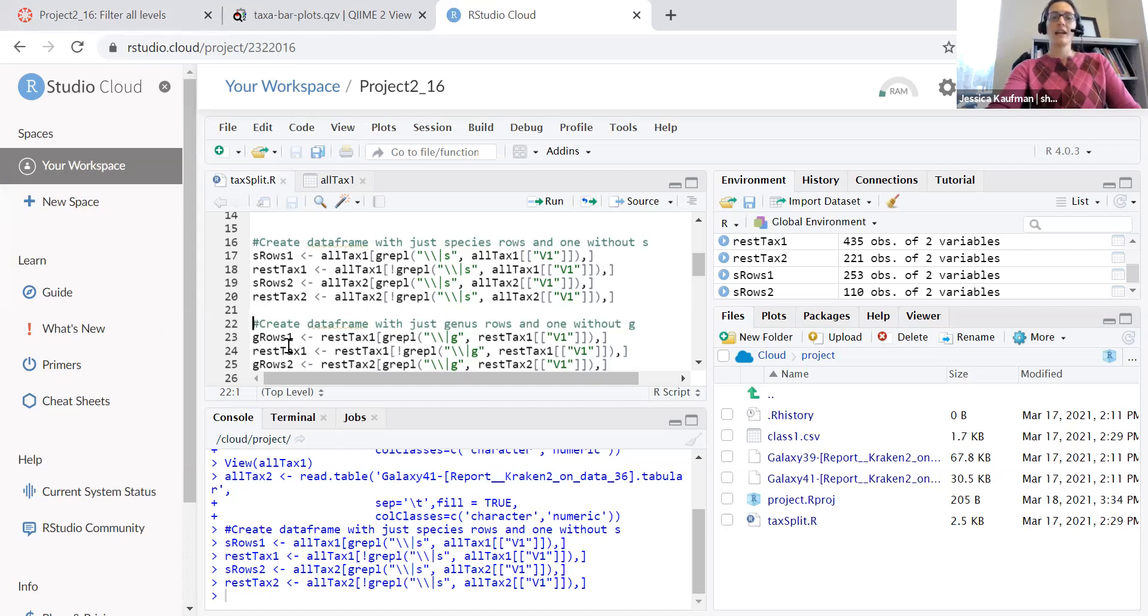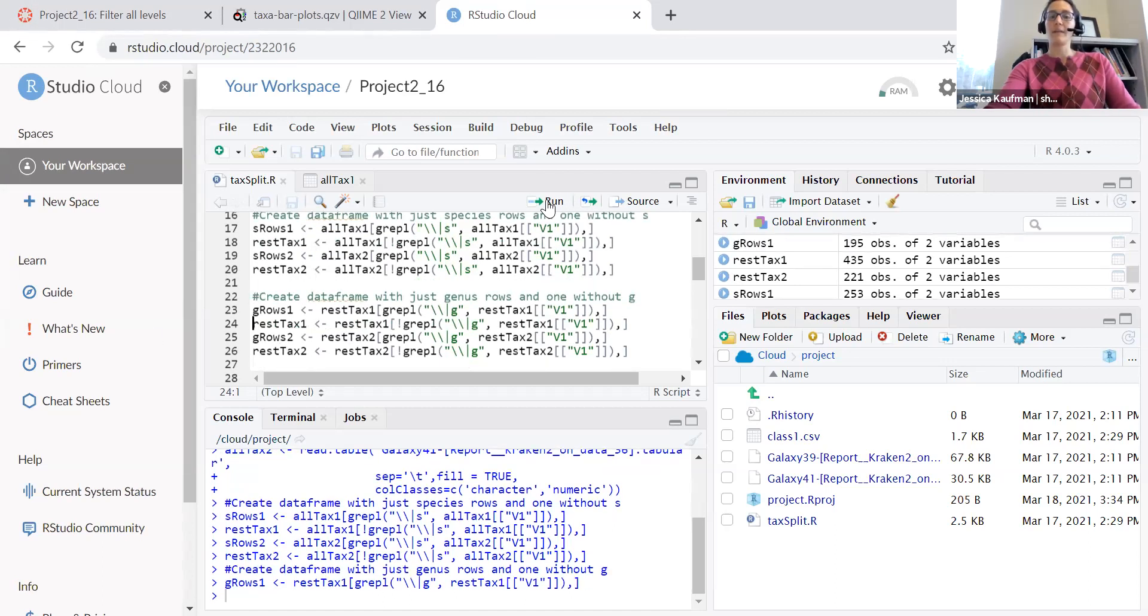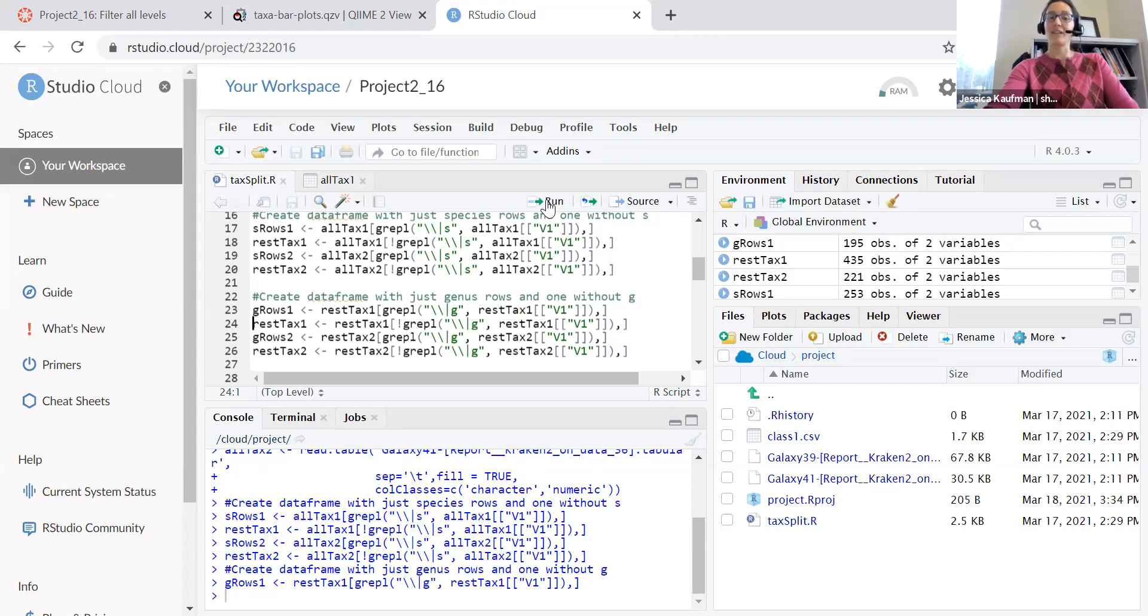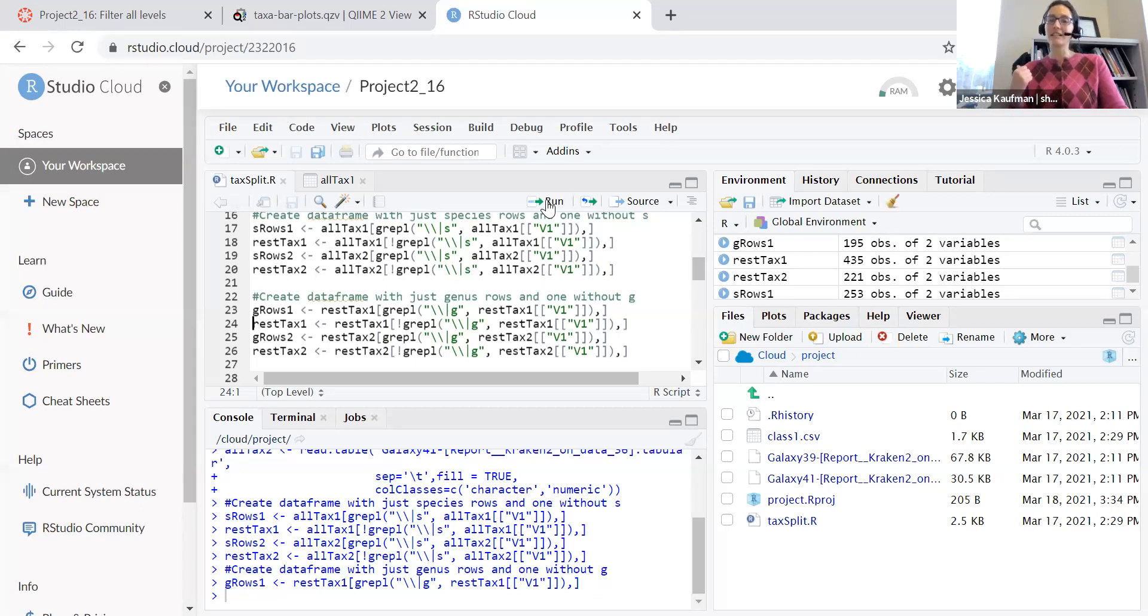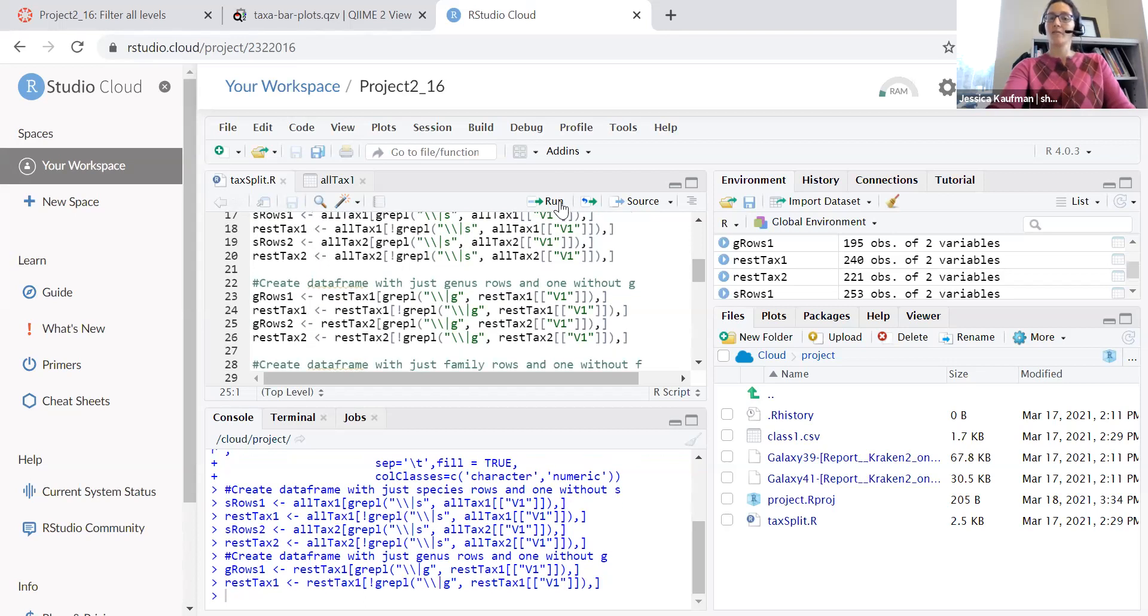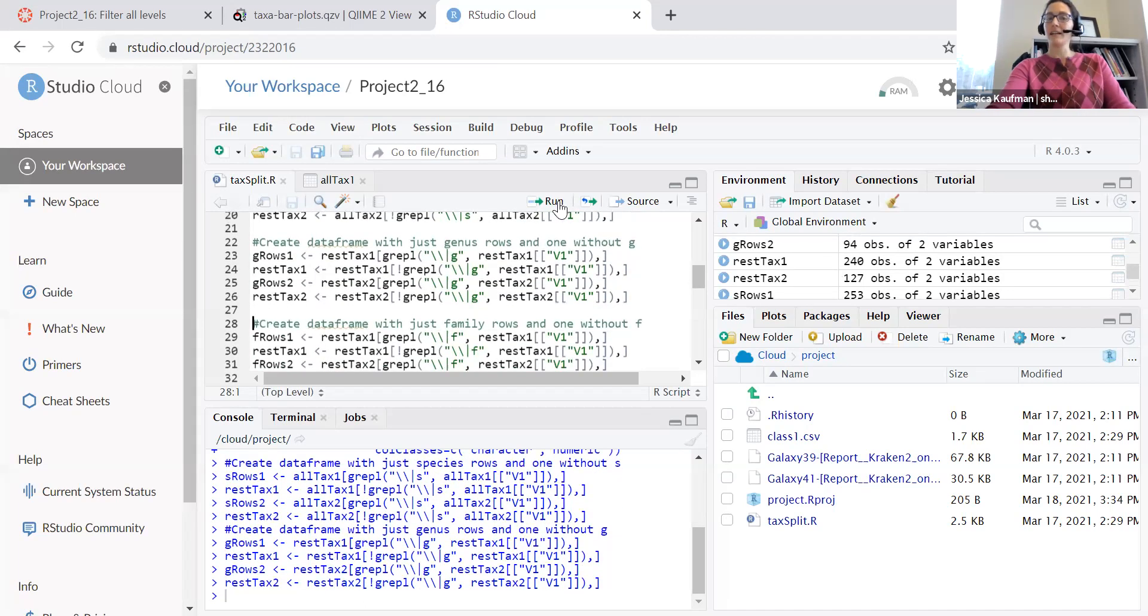So now I'm going to use the same logic to find the rows in rest tax that have the letter G. If they have the letter G in rest tax, G is the final classification because I've already dumped all the species rows. Run rest tax, G rows 2, rest tax 2.